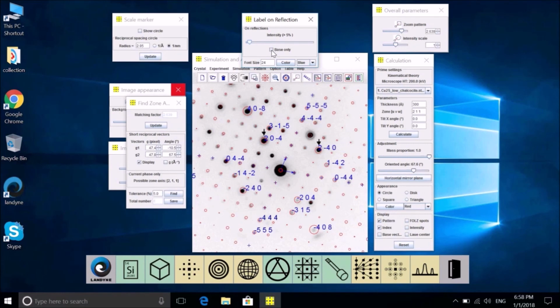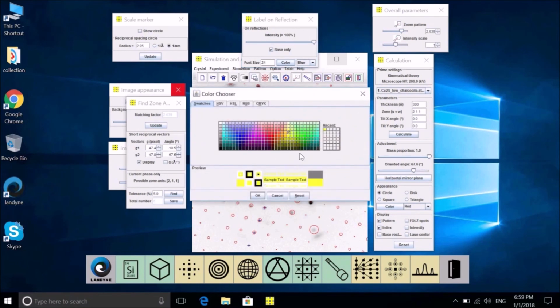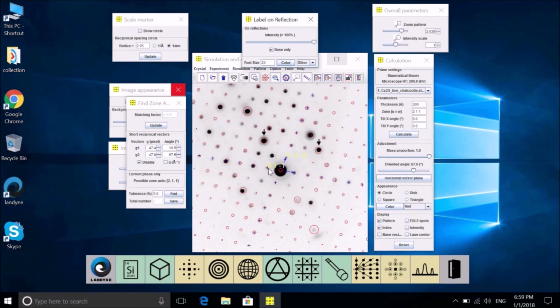Or you just simply go to the basic one. So we got this one is indexed, and also this one is indexed. And inside of this one will be the reverse. And we got some number here, -1. And I can show you maybe in yellow or other colors. Let's try yellow. See if this one will show you a little better, with 0, 1, -1, and this is 1, -1, -1.